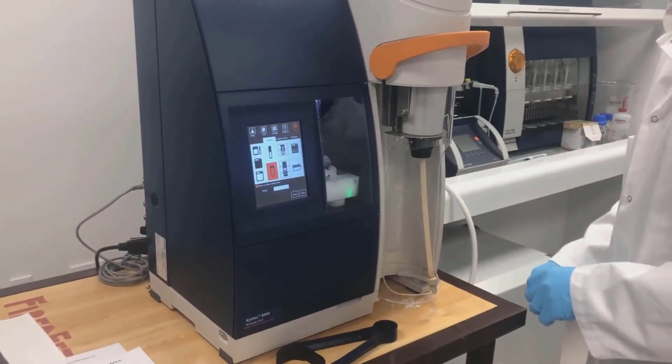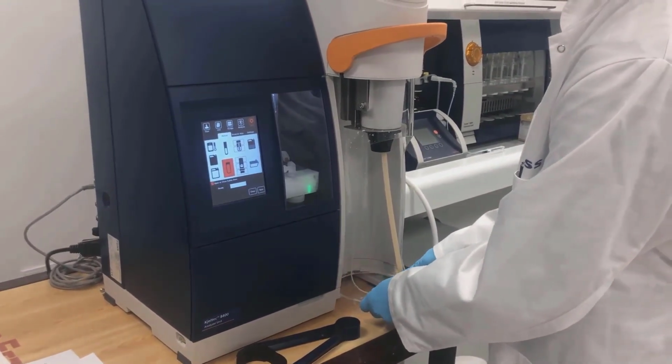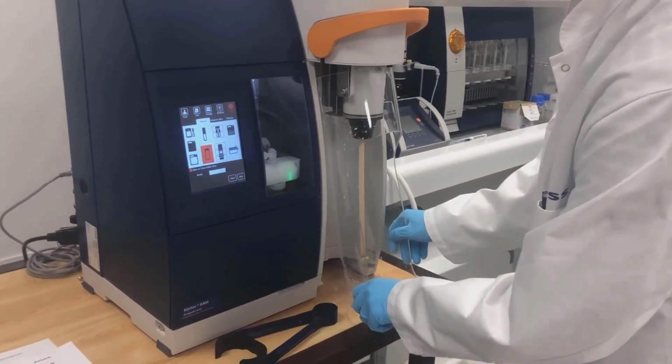Now we will just take out the safety door. The way is that you lift up the safety door a little bit and take it out from the chamber.